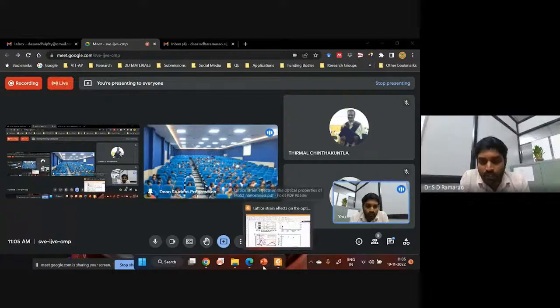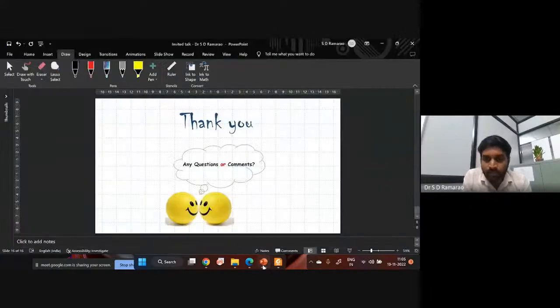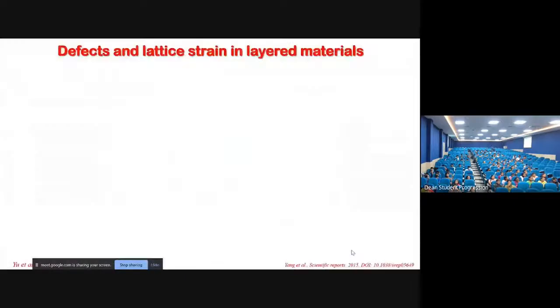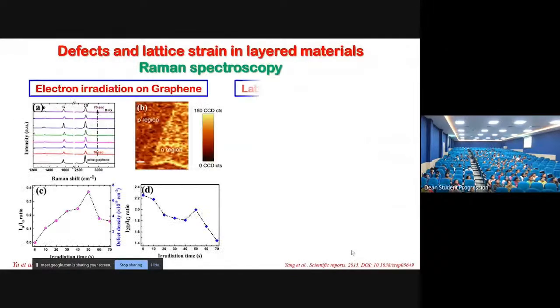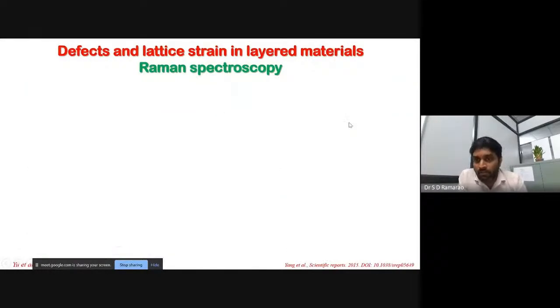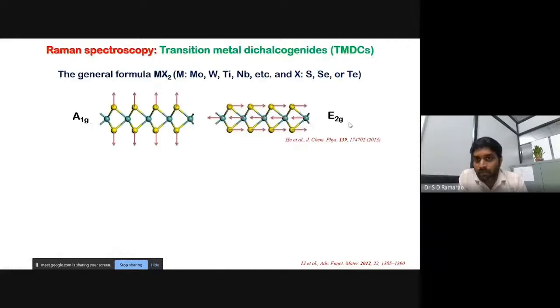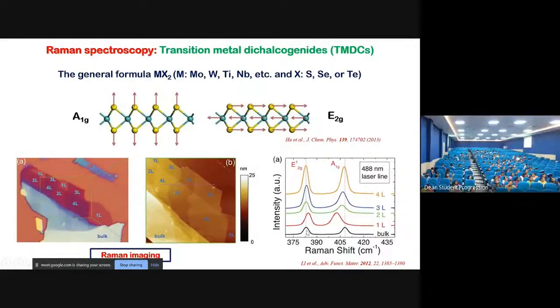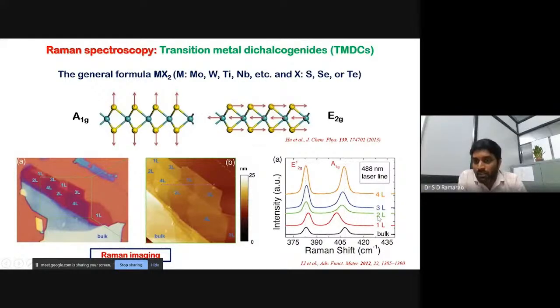I didn't get the five layers. In bulk, it is less intensity compared to the 4 layers. Yeah, bulk we have, and partially this one, not this one, right? The previous one. This one, right? Yes, this one. So single layer, 2 layers, 3 layer, 4 layer.